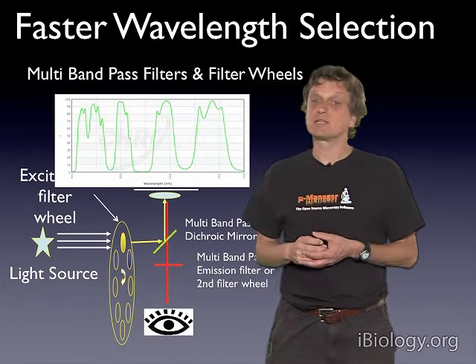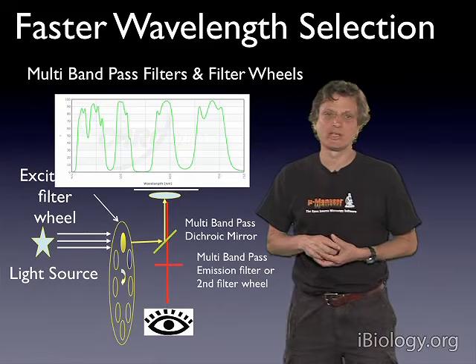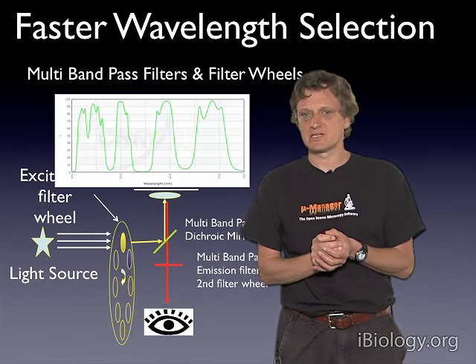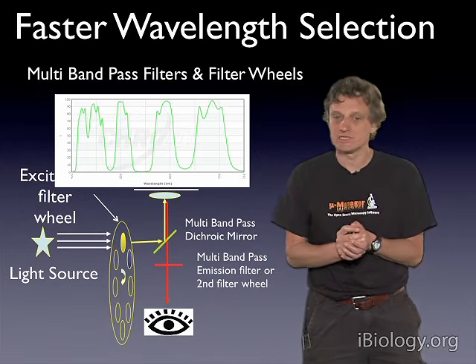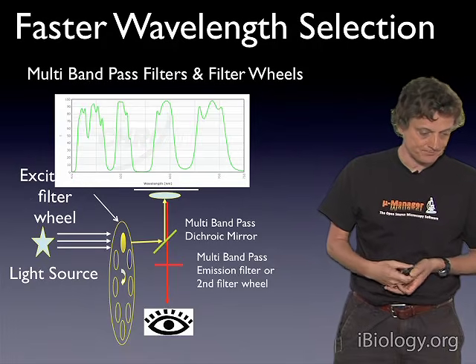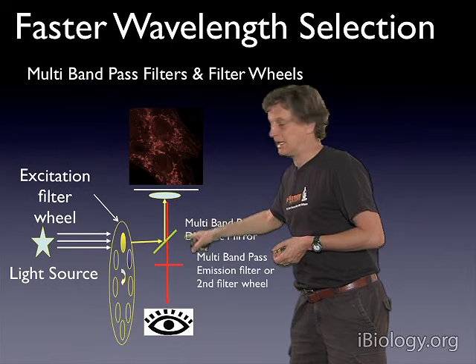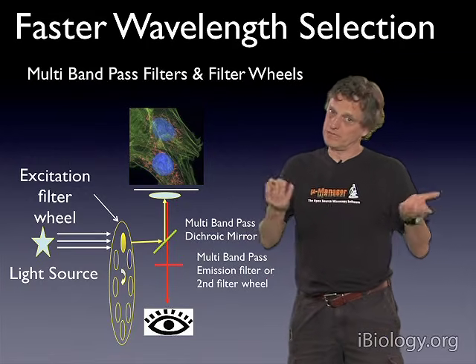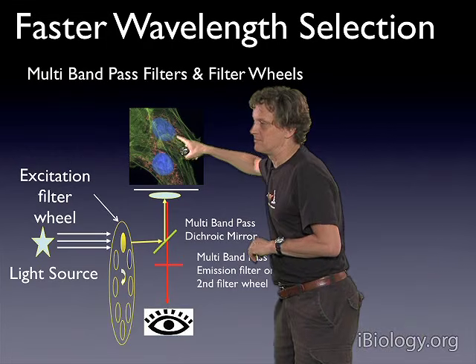And some of the spectra of filters you can buy look a lot better than what I'm showing you here. It's literally amazing what the filter manufacturers have accomplished, and that has been also a great driving force behind the whole progress in fluorescence microscopy. So we had our image of our red dye, and then we put that all back together in the computer in these multicolored images.